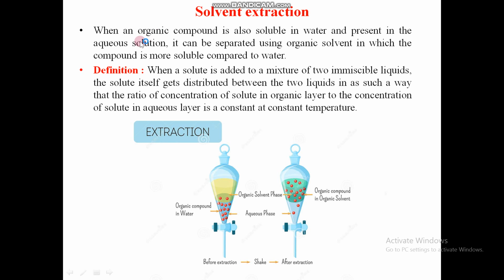Solvent extraction means what? Usually organic compounds are dissolved in organic solvents, but some organic compounds are also soluble in water and present in the aqueous solution. If we need to take the organic compounds out of the aqueous solution, we have to use an organic solvent in which the compound is more soluble compared to water.